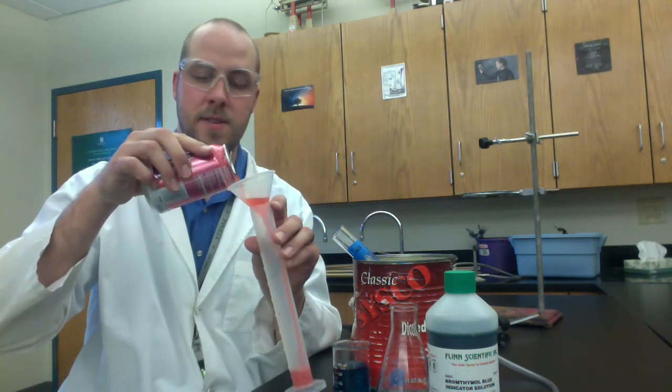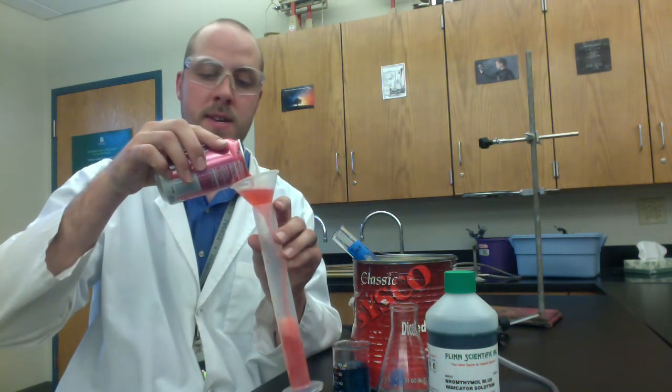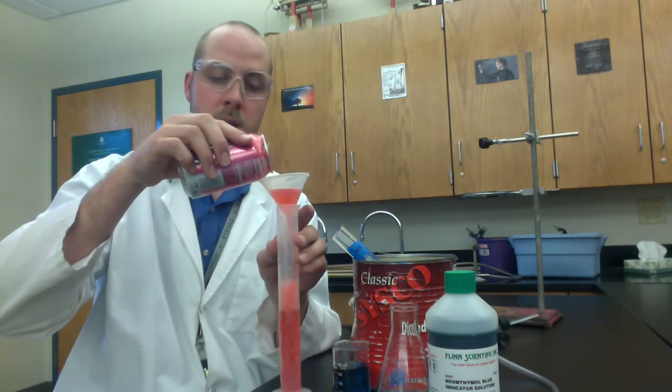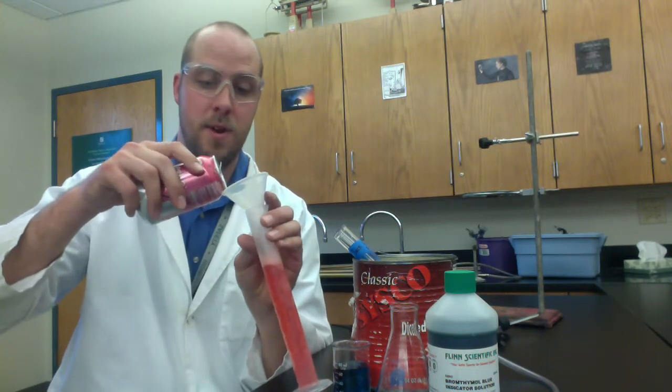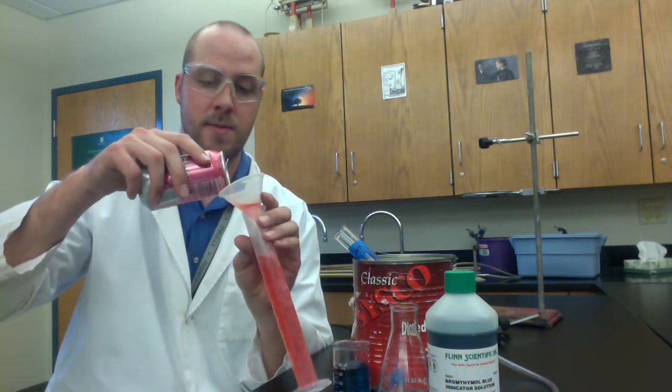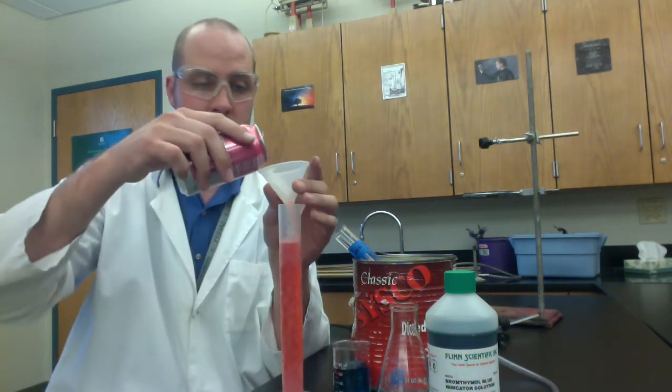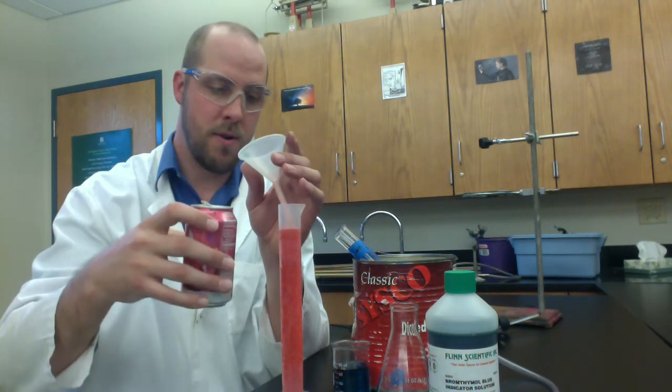Let me talk a little bit about distillations. We've been talking about physical versus chemical properties and changes recently. One physical property is boiling point of a substance. You can separate substances based off of different boiling points. There are actually four different substances in a soda that we want to separate by distillation. Sometimes it's called a fractional distillation. Fraction just means breaking down into smaller parts. So we are fractionally distilling four components here.